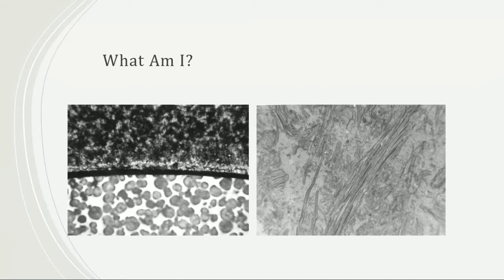You can confuse this with steel, especially if it has graphite. So not necessarily steel, but iron, cast irons that have graphite flakes and other inclusions and/or slag material from being a casting. But this is actually a phenolic resin. And that's just what it looks like in the cured condition under the hot press.